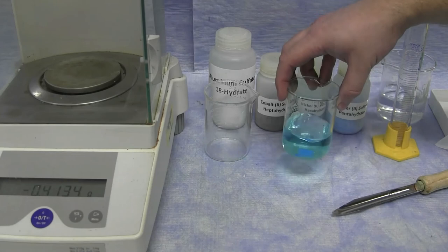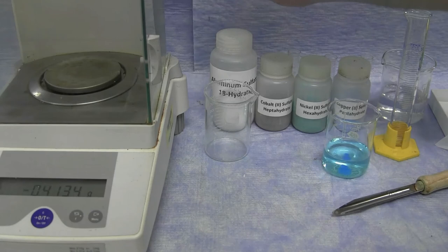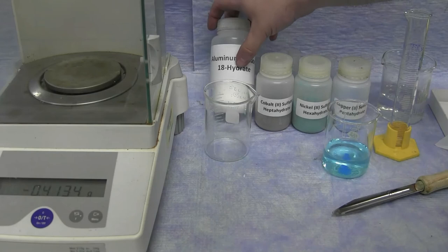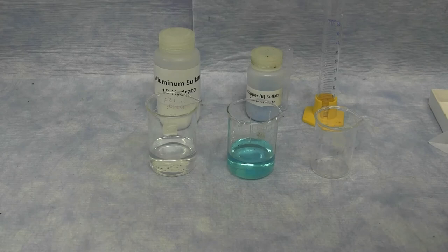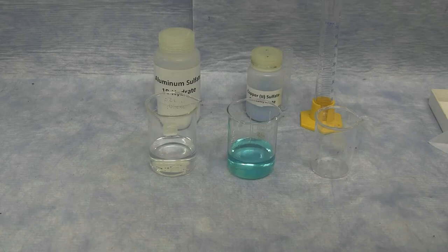You will also prepare a solution of aluminum sulfate octadecahydrate. Aluminum sulfate salts contain a large amount of water in its hydrated form, so you need to remember to include all of the water molecules when determining its molecular weight. With the mass of each material, you can determine the moles of each material, and using the volume of 50 milliliters, you can calculate the concentration or the molarity of each of the two solutions.